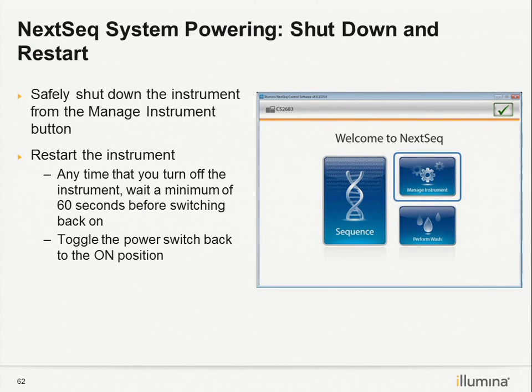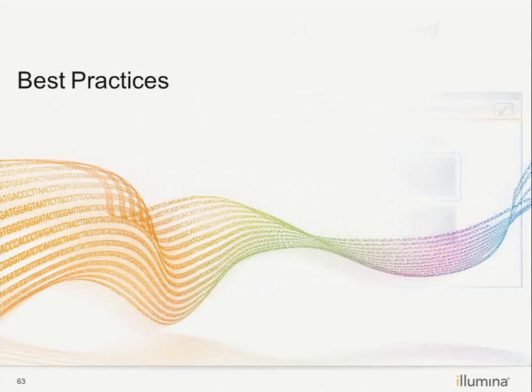And for shutdown, if you want to do the shutdown, just do a manual wash, and then you toggle the main switch at the back of the instrument. And if you want to switch it on again, for example if the window hangs, then you probably want to force shut down, and then you turn on the main switch of the hardware, and you need to wait at least 1 minute before you can switch on. So give it some time to cool down before activating it.